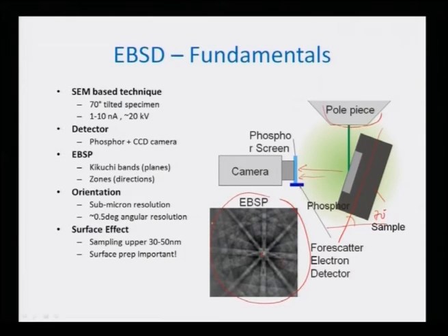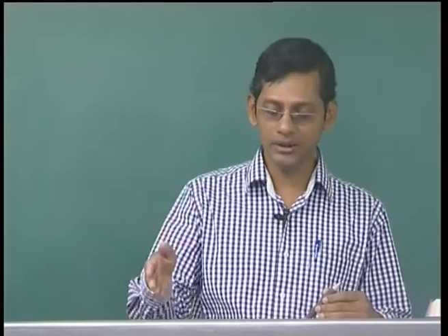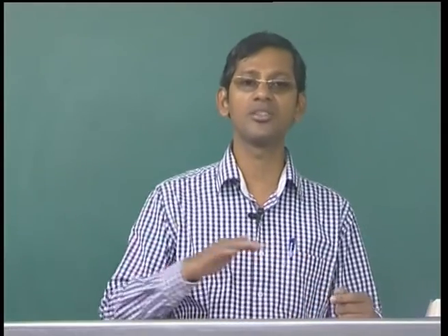Now if you have a very large number of crystals in a sample, one can actually obtain this information from each point of the crystal and then process it. This is how experiments are actually done. But remember that the sample needs to be very clean, it has to be electropolished in many cases to obtain an oxide-free surface layer, so that a very good quality diffraction pattern can be obtained.